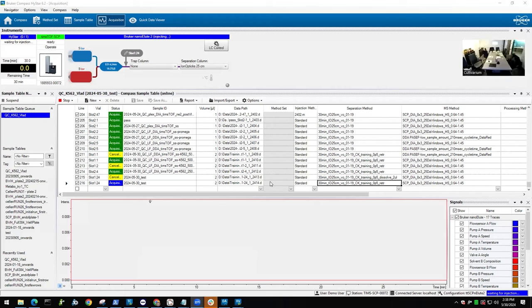So what we typically use are these sealing foils, which are mounted on by heat. So you can either use a conventional heat sealer, or I think PCR cyclers can be used as well, but the normal ones are probably better. Depending on what plate type you use, for the 96 ones, there are also the zone-free sealing foils, which can also be used. They're self-adhesive, but they have the glue only on the outside and not over the actual well of the 96 well plate. They're not available for the 384, but for the 96, they are available.